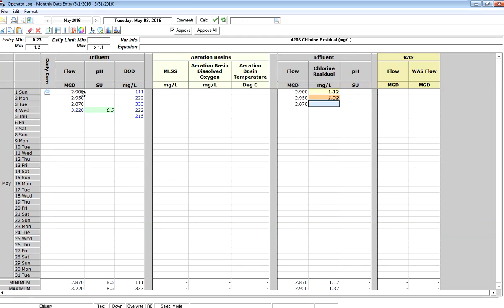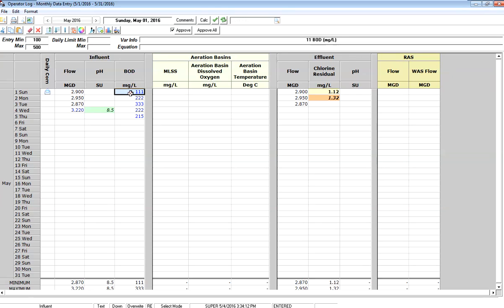There's a couple of other things you need to see on this form that's interesting. One is the color - the foreground color indicates the data approval status. So in this case, this number that I just entered, 3.22, if you look on the status bar, it says that data is entered.